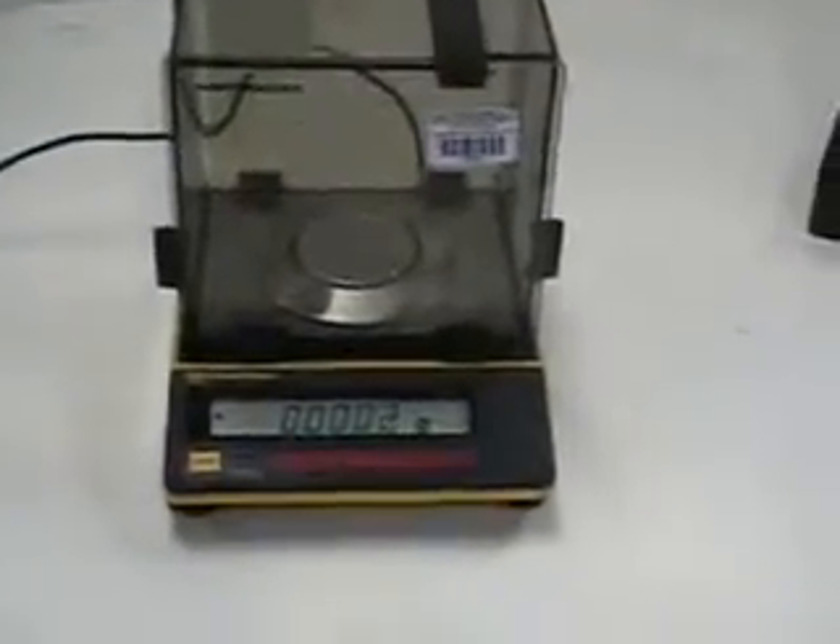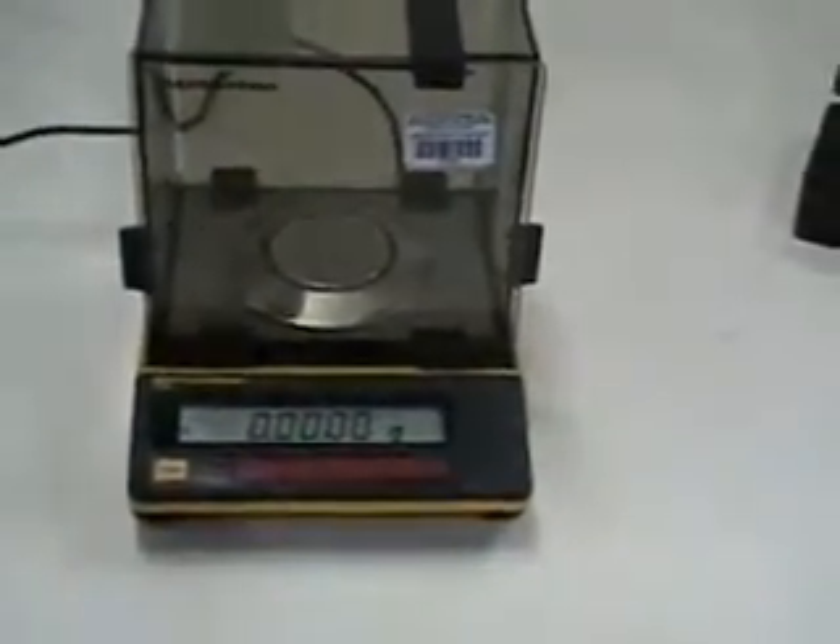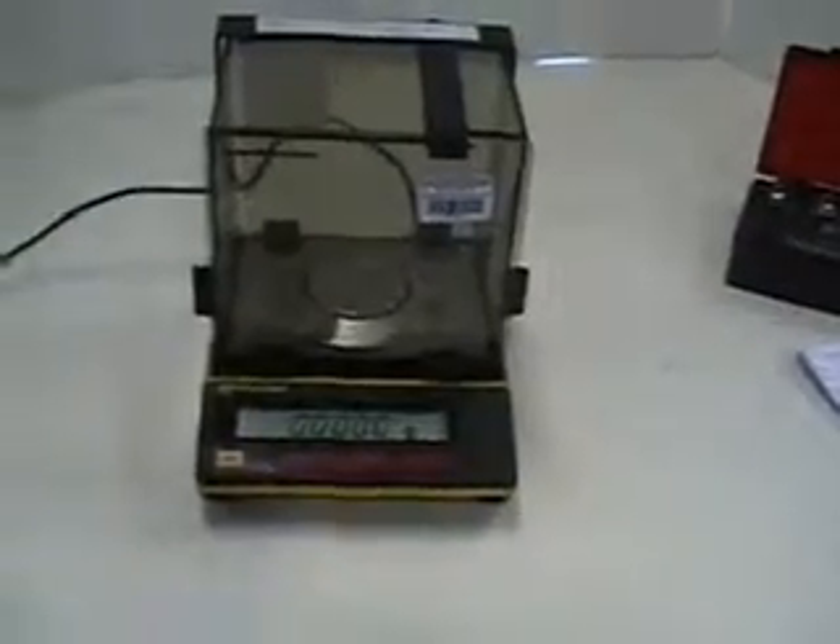Good afternoon from HiTechTrader. This is a Satorius Handy Analytical Balance. It goes up to 30 grams, four decimal places. It's in great condition.